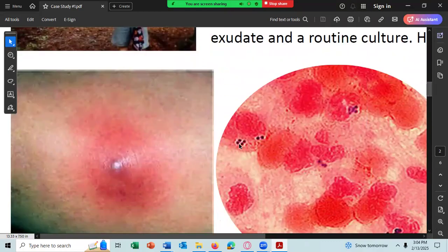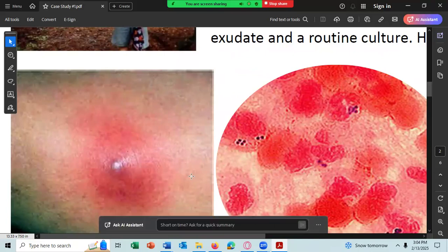The bacteria there, you can determine what the shape is. You might even notice the growth pattern. That's not terribly critical, but the bacteria are gram positive and his own cells are gram negative. Let me shrink that down now.